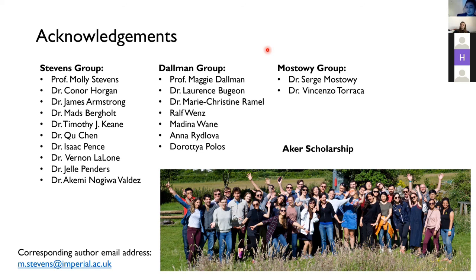Possibly. I think the limitation we would have there is that the resolution is quite slow, so we would probably need to keep the fish alive for a couple of days. I think that would not necessarily be an issue with the Raman system, but more with the embedding and making sure we always image the same area of the fish.